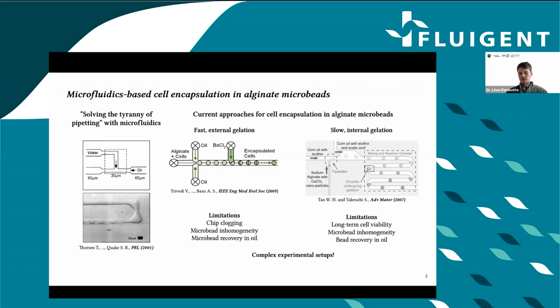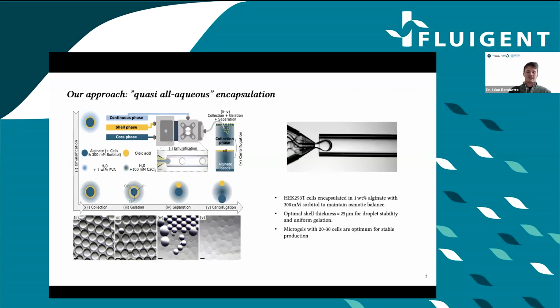So this is mainly the reasons why 3D cell culture in alginate microbeads is still limited to purely microfluidics-oriented labs, and it's hard to transfer this to more biology-oriented labs due to complex experimental setups and procedures that currently slow down this field. So this is precisely where the Raydrop chips come into play, and I will leave the floor to Adrien to explain the technology we used in this project.